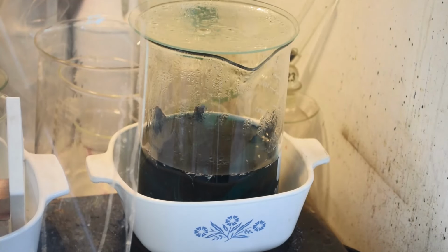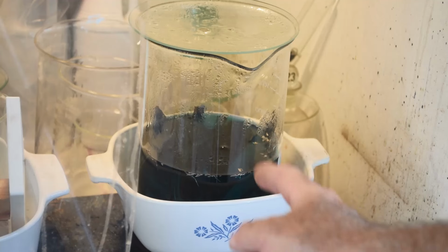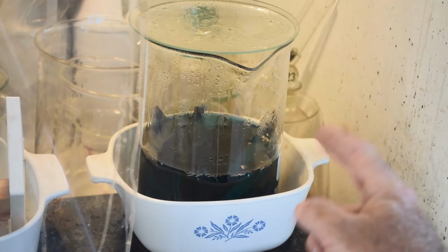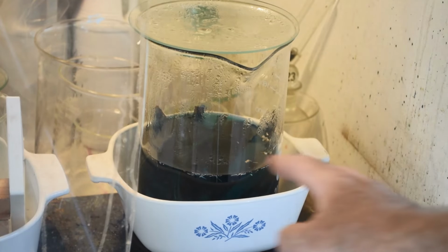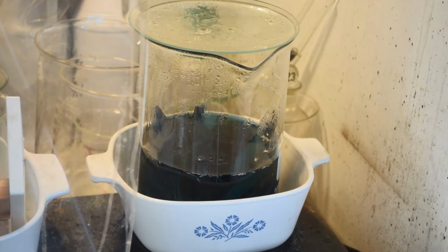So we got a bit of an interesting development here. I went away for lunch with some friends. Was gone for a couple hours. I just left it on low heat. Came back. The liquid has gone from deep green to deep blue. And there's some, I don't know if it's showing up, but there's some metal foils floating in there, silvery metal foils.